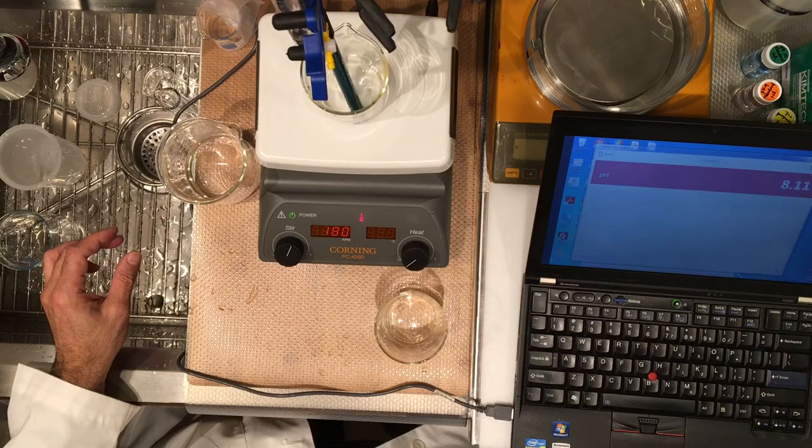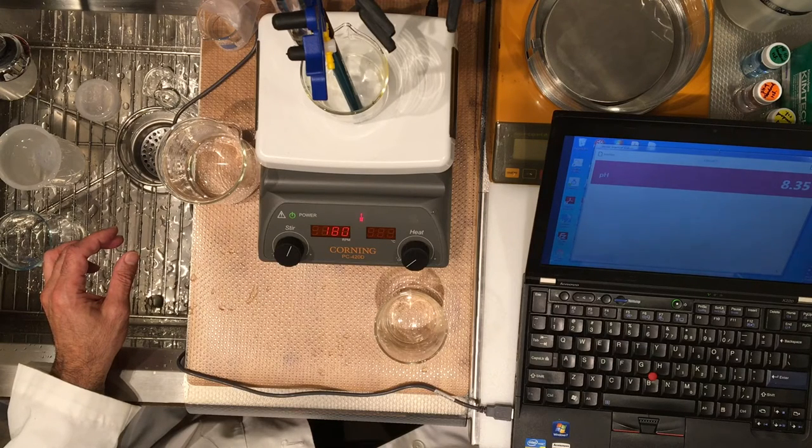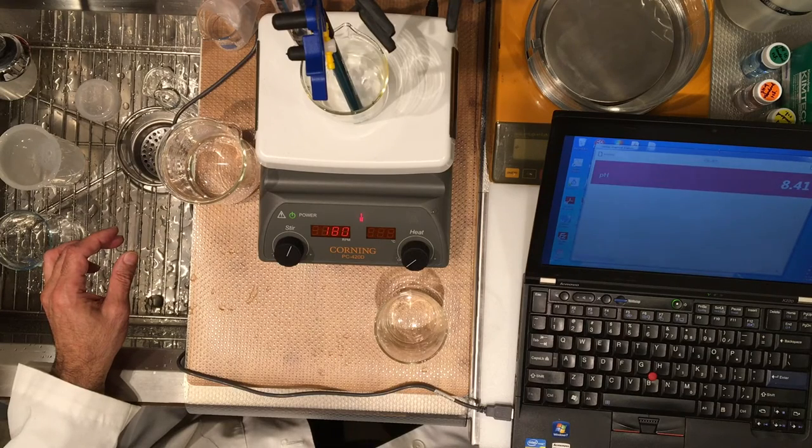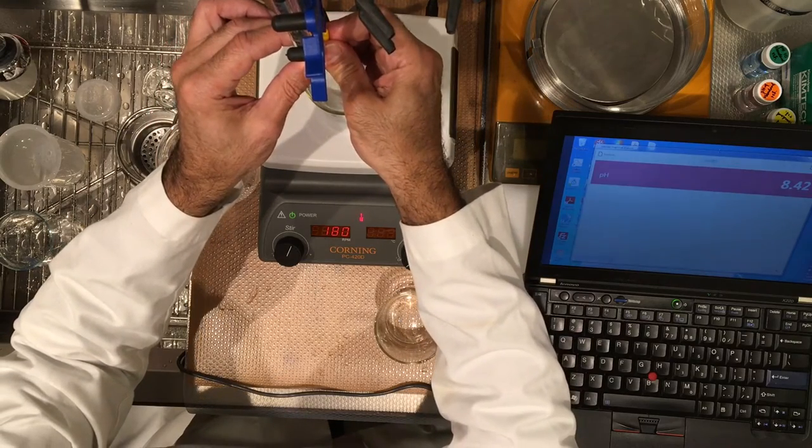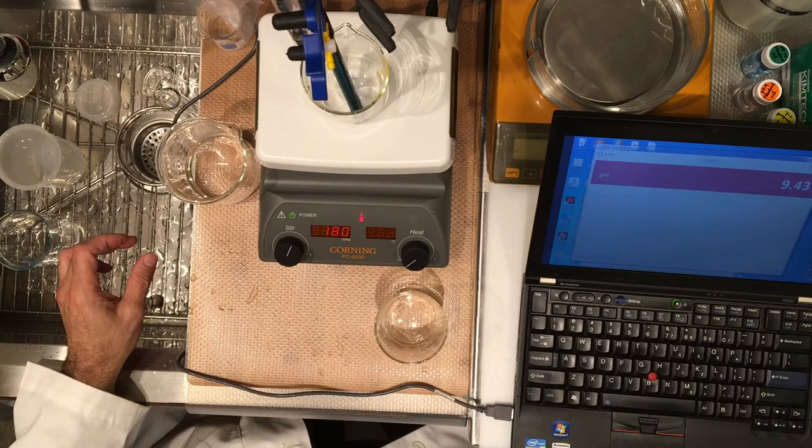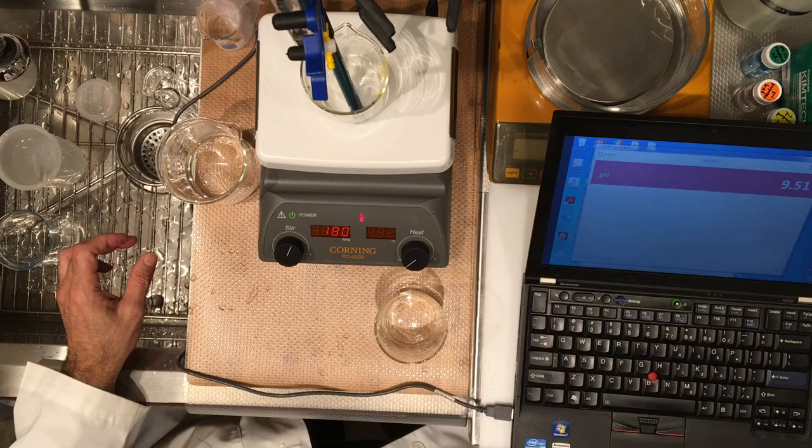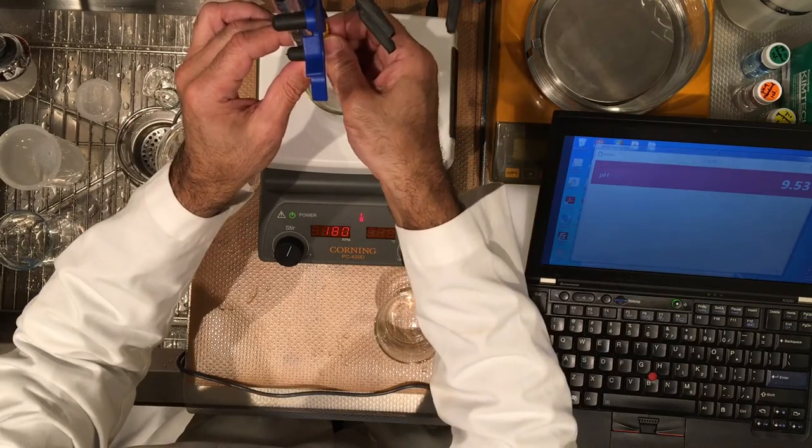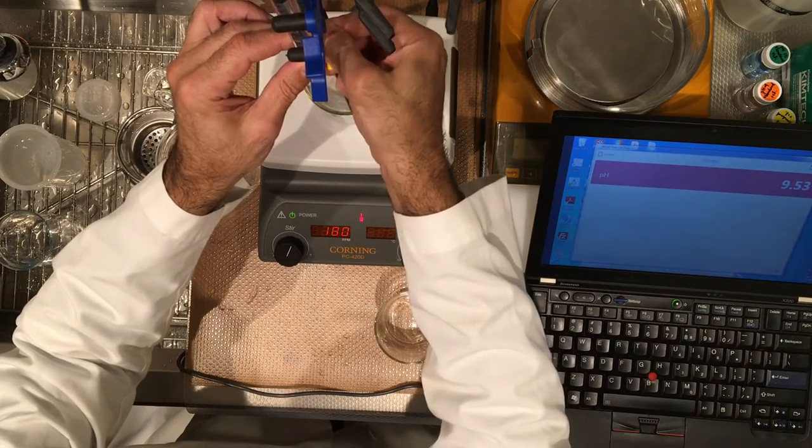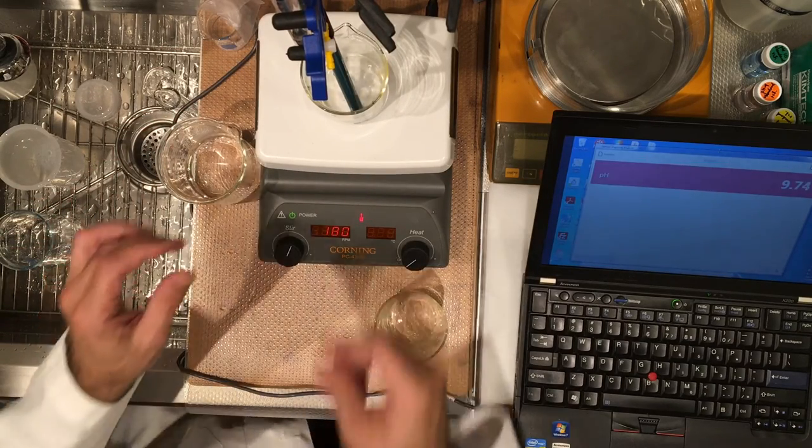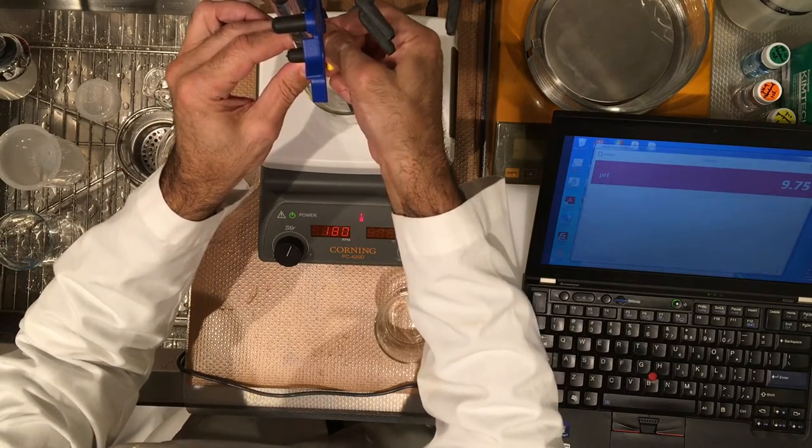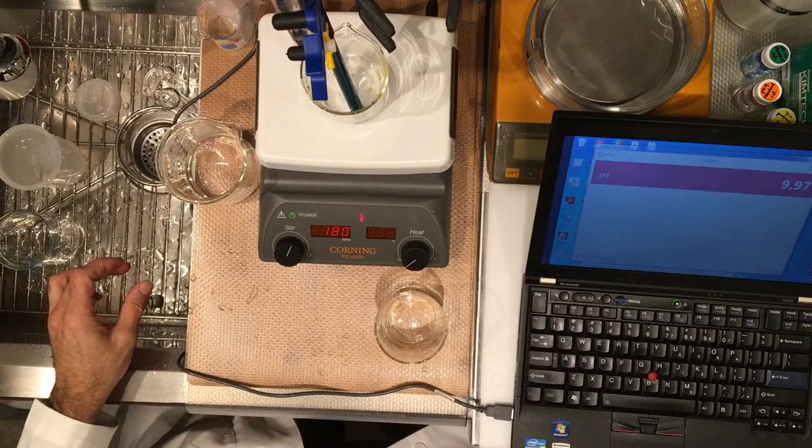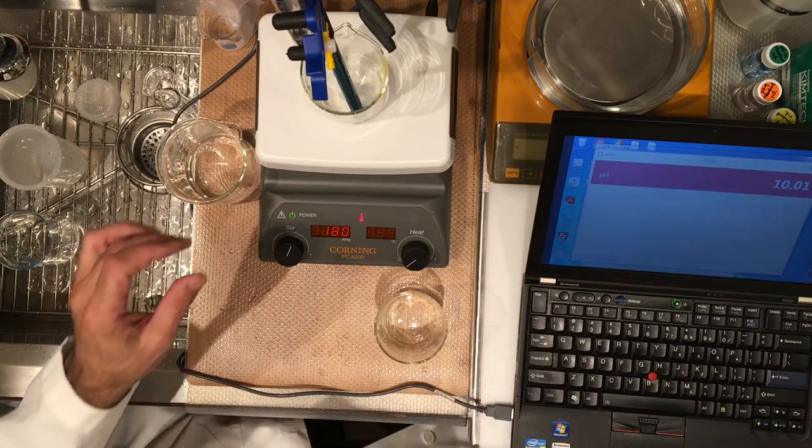10.70. Record. 11.20. Record. 11.30. Record. Now let's go to 11.40.